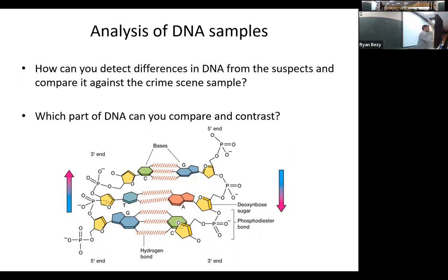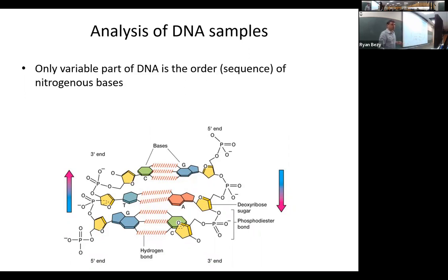Don't get me wrong, your DNA is probably 99.9% similar to everybody else sitting in this class. But there's still some differences there, and they're detectable differences via some different kinds of techniques. But that also means everybody's DNA sequences are unique. Remember, DNA is information. DNA is information that codes how to put your cells together, but also how to put you together. And if you don't look exactly like somebody else, that means you have differences in your DNA, differences in that information. And we could detect those differences via some other techniques.